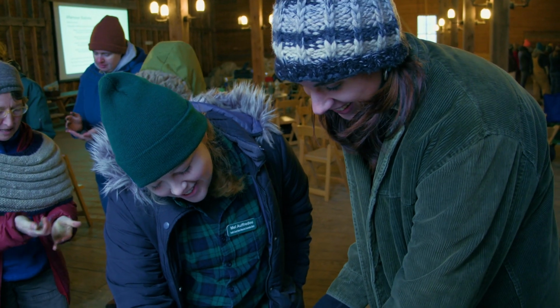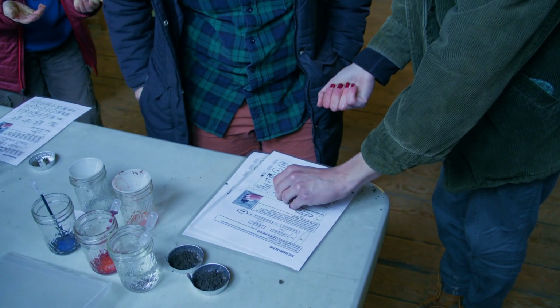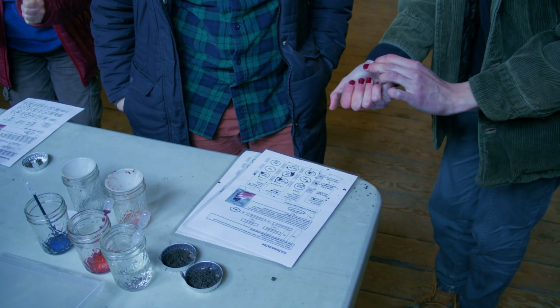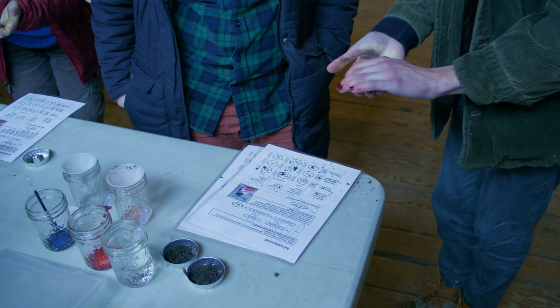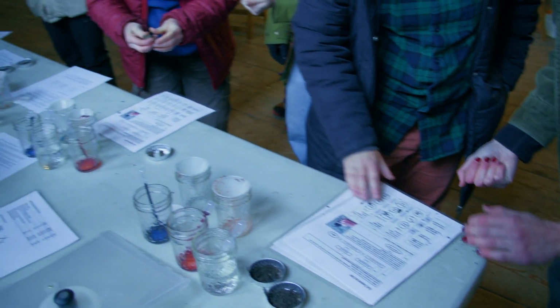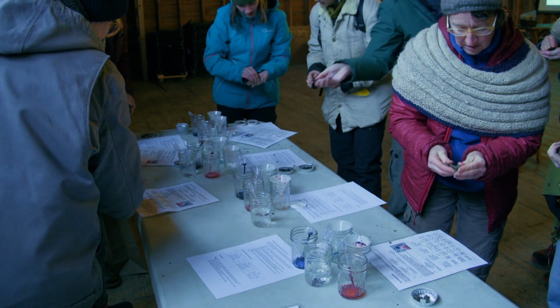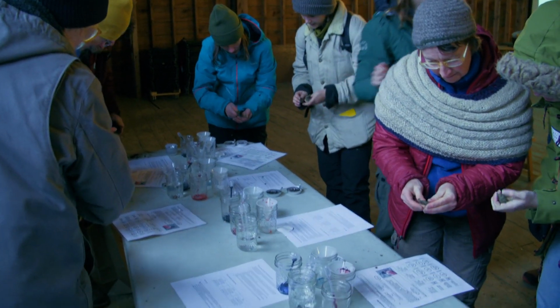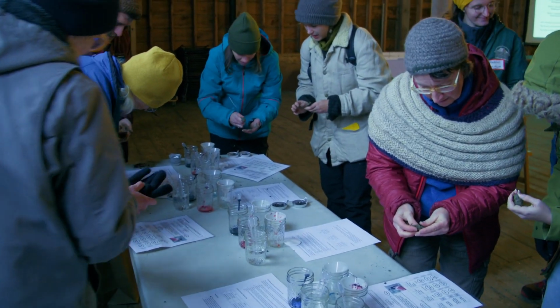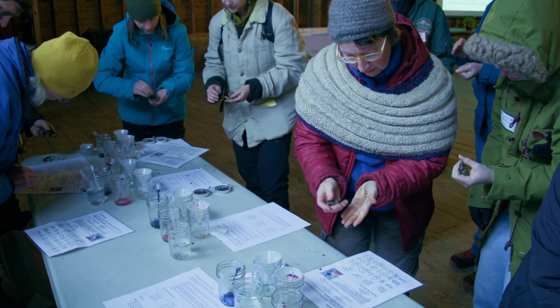So I think we have sand on our hands. You may have a loamy sand on your hands. Is this from the roadside, perhaps? It is. It makes sense. Okay, so we have loamy sand. It's a lot of sand.